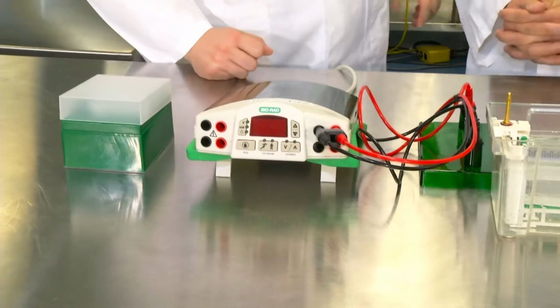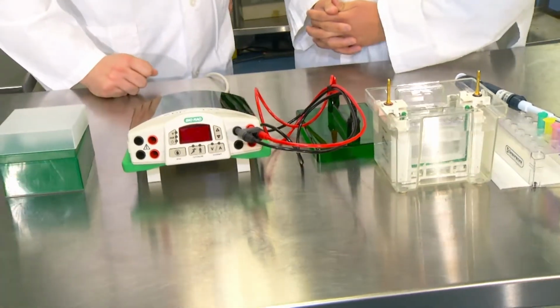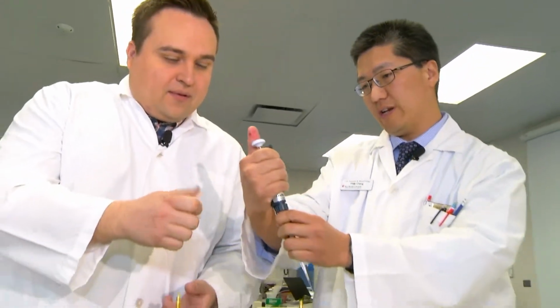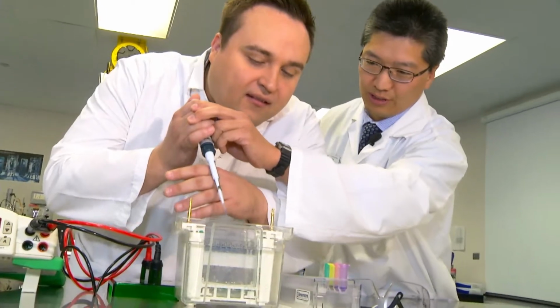This machine is what we call SDS-PAGE. It's used to analyze protein profile. It has a sample in it. We took this. Okay. There's a sample, and you want to hold it in such a way that your finger rests right at the grip. Like this. That's right. Now press the plunger. There you go, and then lift it out. And you've just loaded your first sample.